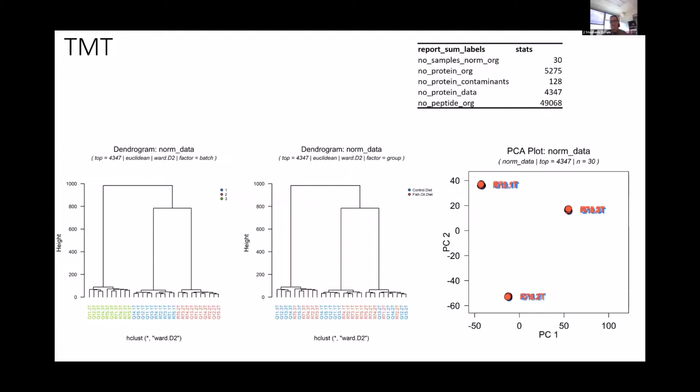So keratin comes off of your skin when it's in the lab, it's in the air. A lot of those are included in the contaminants database. And MaxQuant will flag those protein IDs with CON so that you know it came from either your real database or the contaminant database. The algorithm also does a search with the reverse of all of those sequences. So it'll use the reverse sequence in order to determine the false discovery rate of identification. So anything that hits to the reverse sequence will be flagged with the REV at the very beginning of that sequence ID, the protein ID.